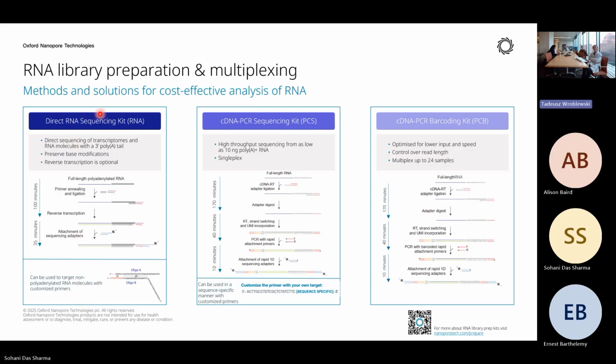The entire RNA sequencing for the direct RNA platform happens in 3' to 5' direction, but the software actually reorients it. So the data you are going to get is in the correct format, like 5' to 3'. A correct format means what we conventionally use, right?